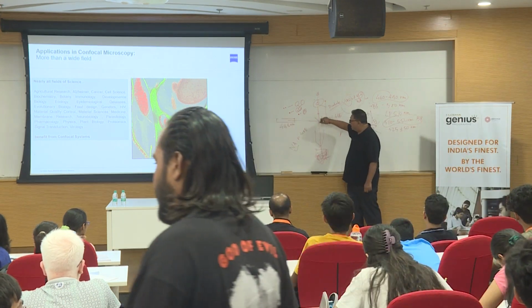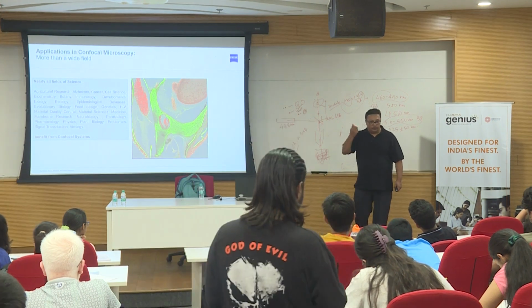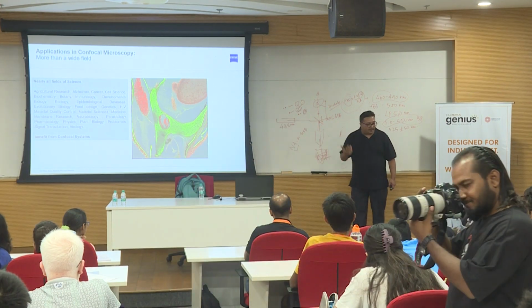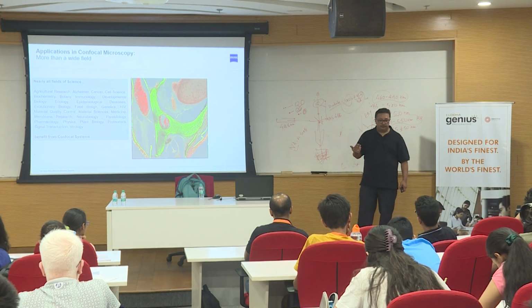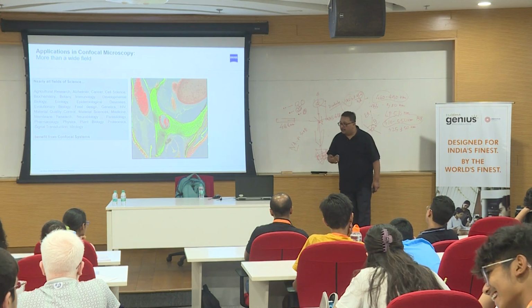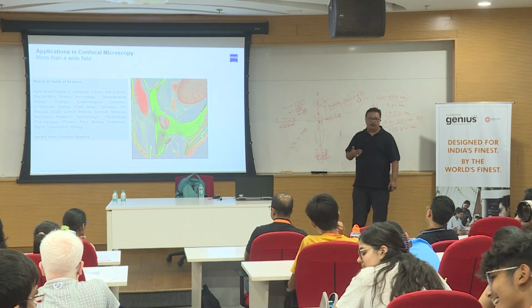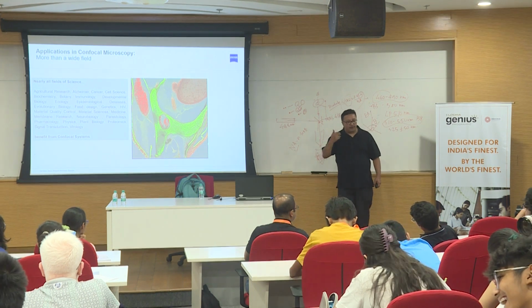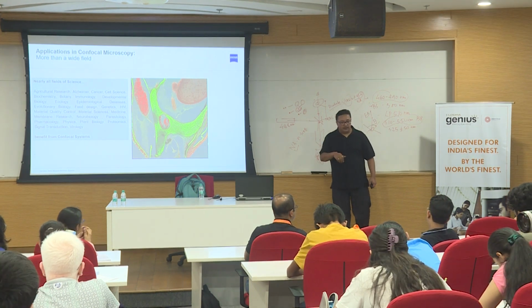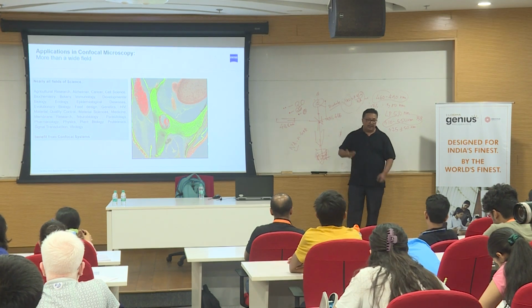So it means that unless your sample is good enough, less prone to bleaching, and stable, only then can you expect to acquire your data with a confocal. But if your sample is dull, bleaching fast, or not stable, you will not be able to acquire your data, because lasers have higher energy as compared to non-coherent white light, and you will bleach.